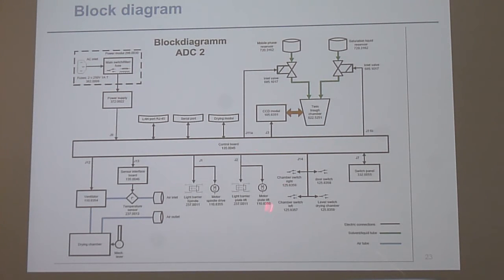Just quickly, there is the motor for plate lift, so up and down. That's nothing big. Okay, so the CCD module we have. There is a CCD module which is at the back.